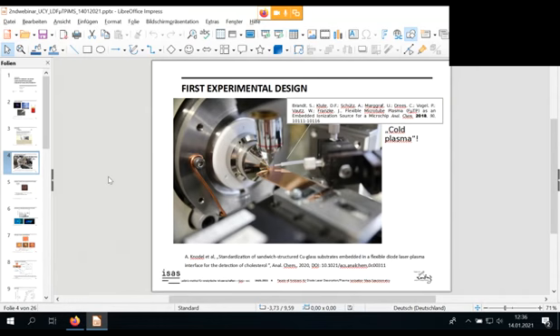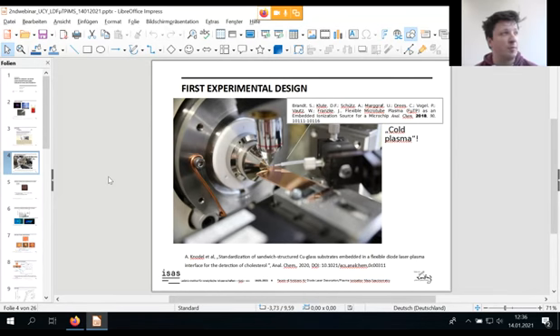I have a question. Alex, what is the total size of the diode laser and how much does it cost? Is it something that could be produced easily and not very expensively? Yeah, I think the laser diode costs about 100 euros or something, sorry if I'm mistaken. It's not that expensive for a laser, and the size is basically a box. It's very, very small, like the surface of this glass, so you can basically put it anywhere.